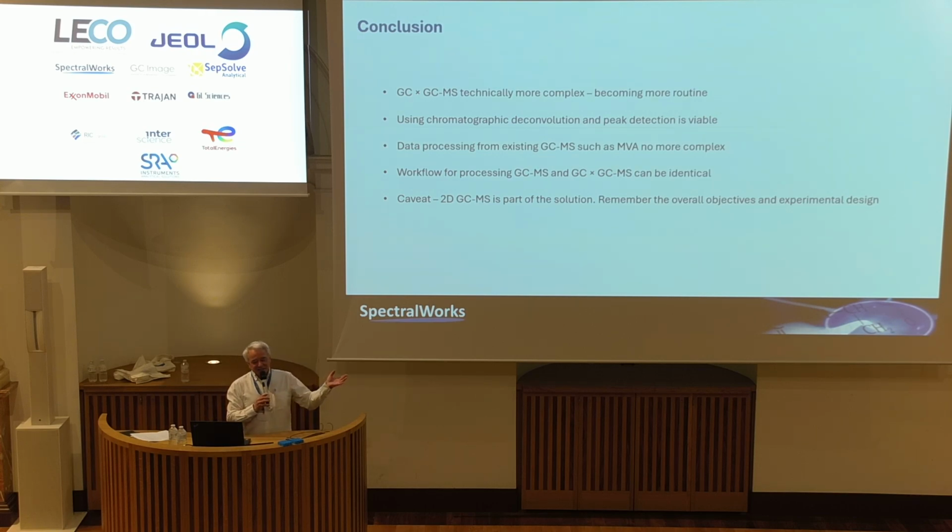2D GCMS is only part of a solution. Remember, always, and a number of times I've seen this and it's been terrible, think of the objectives that are going to be met and the initial experimental design. Because you can have the best chromatography in the world, but if you've got a poor experimental design, you're going to show nothing.